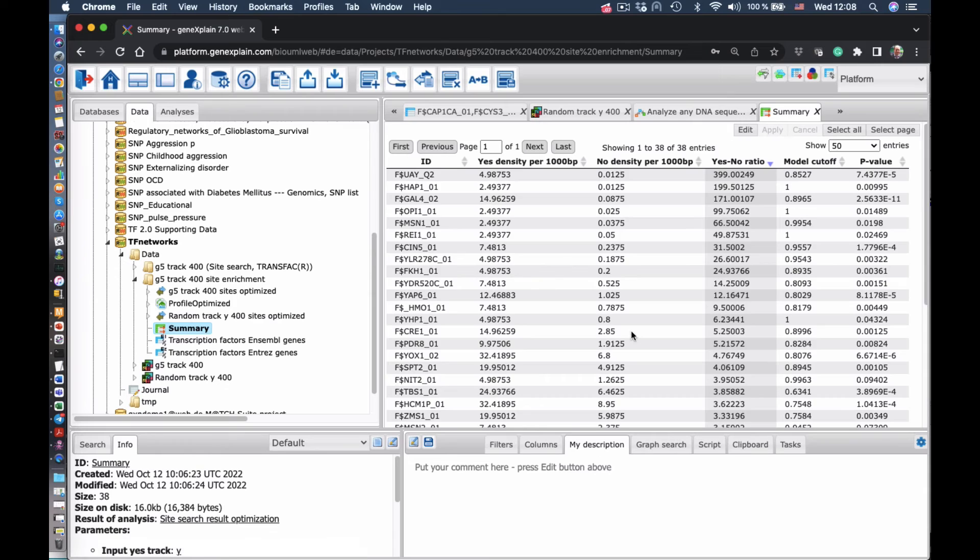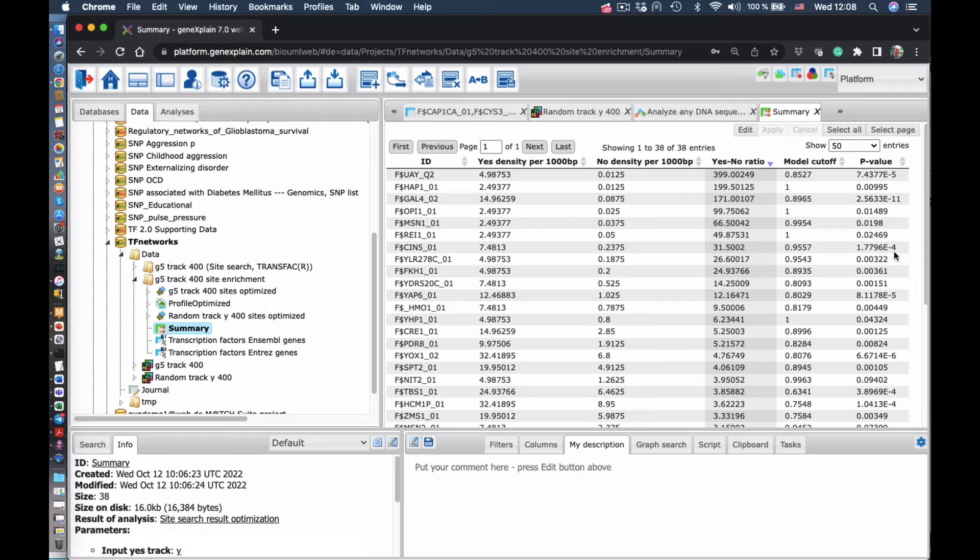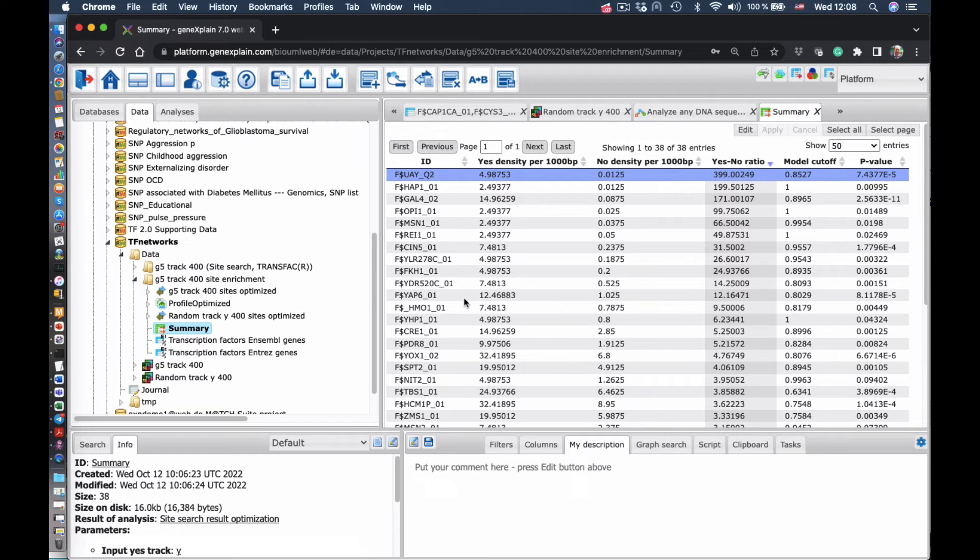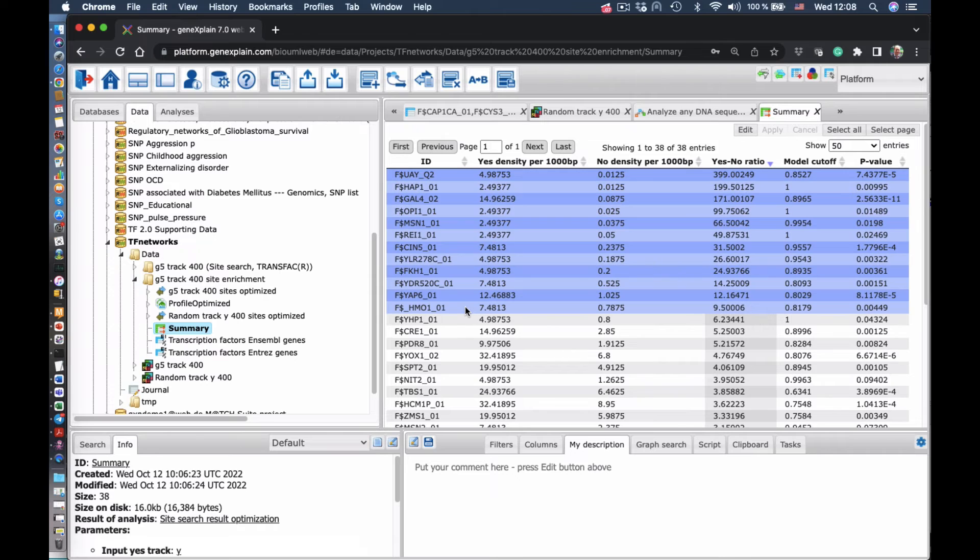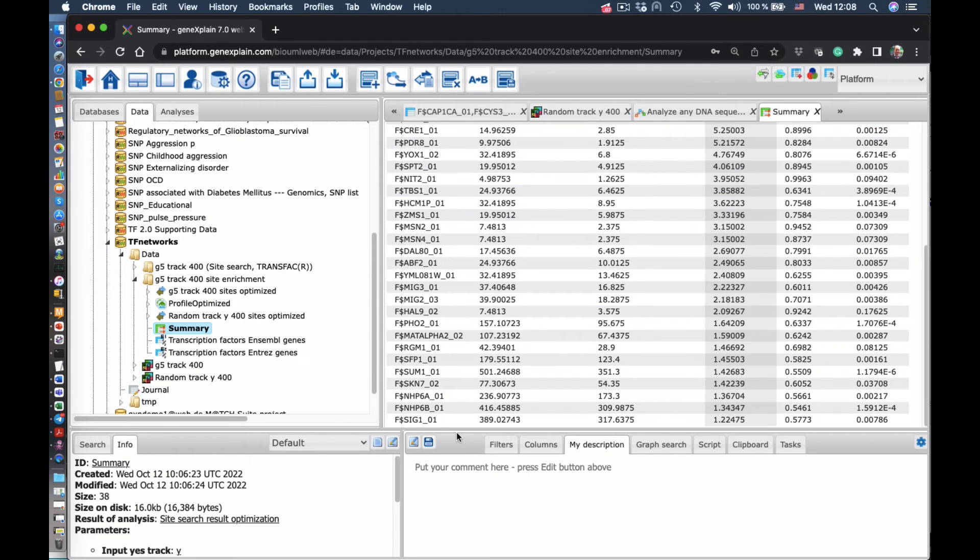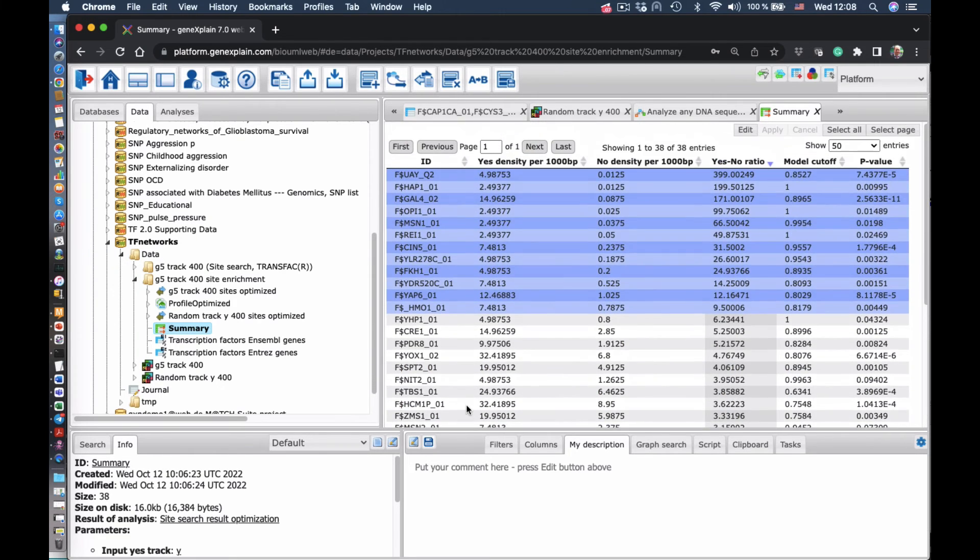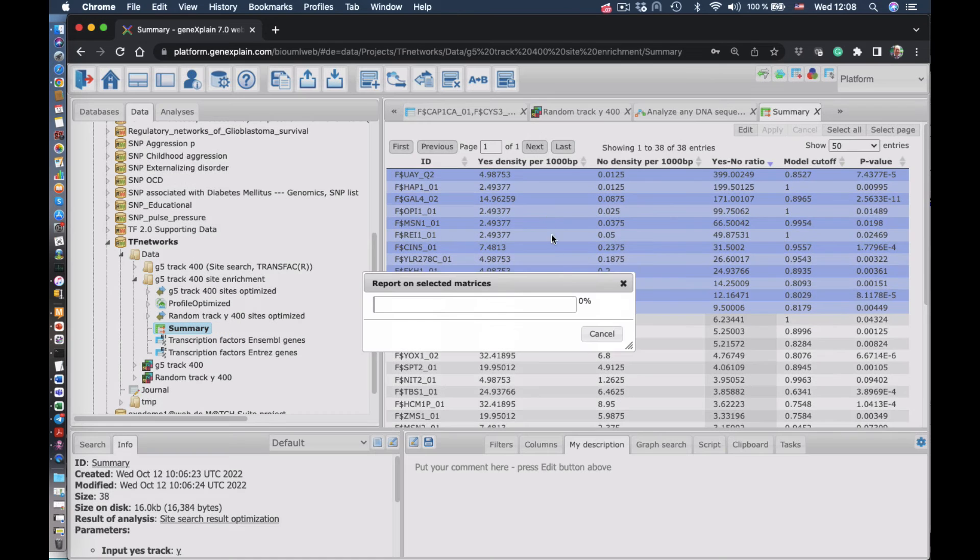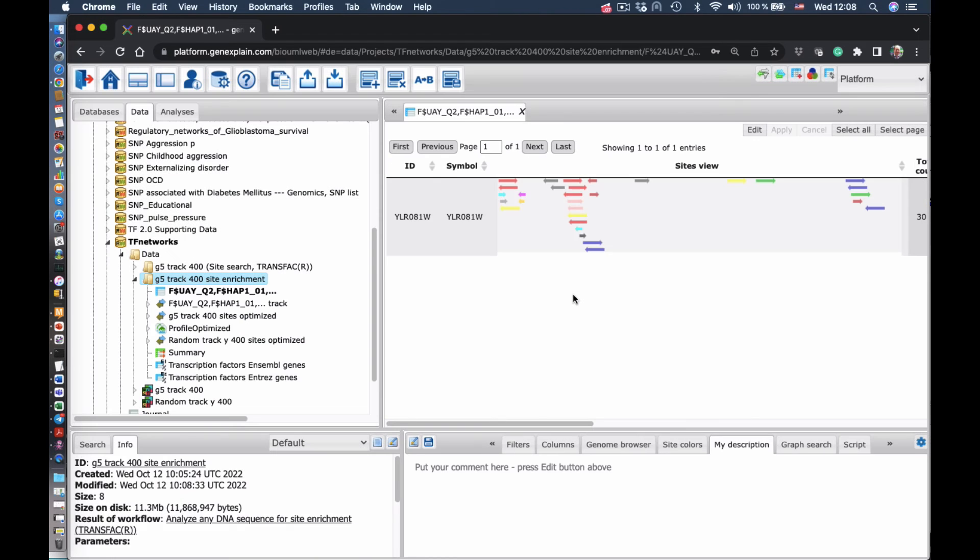And we get a bit more complicated table, where for each matrix we see the enrichment score, the yes to no ratio, which tells you how much of these sites are enriched. Again, we can select several of the matrices and visualize them on that promoter.